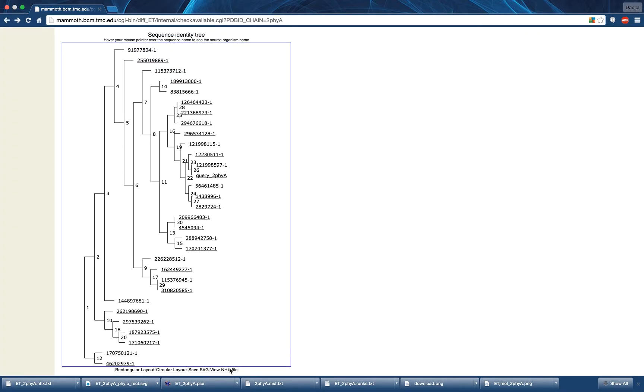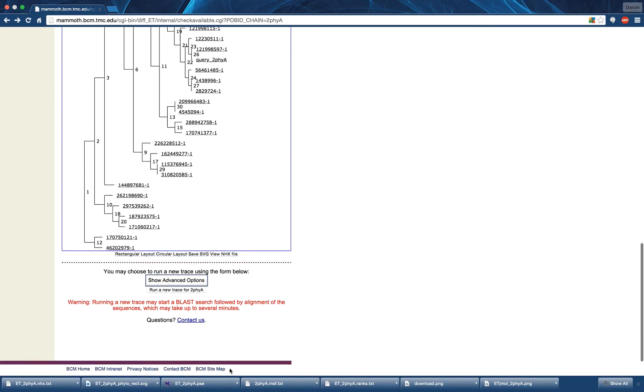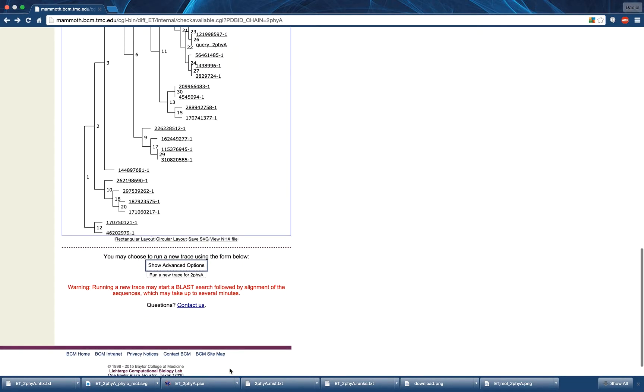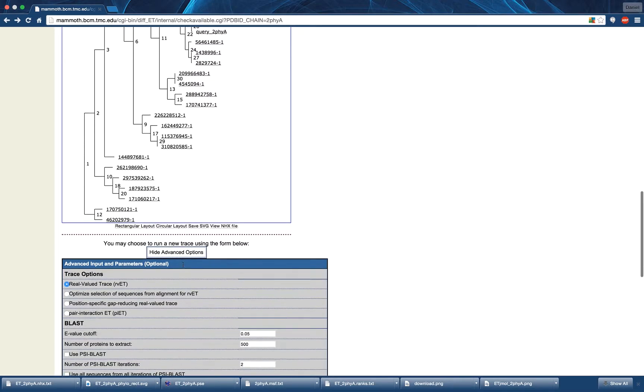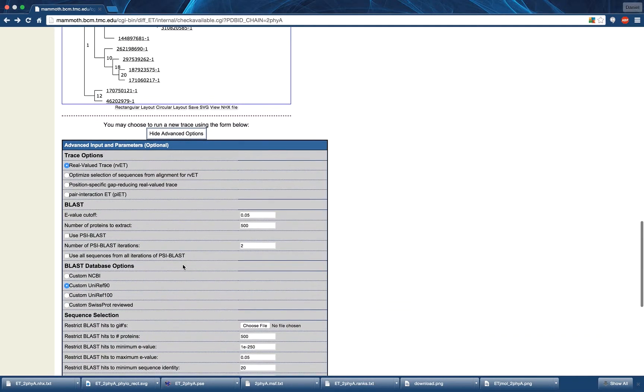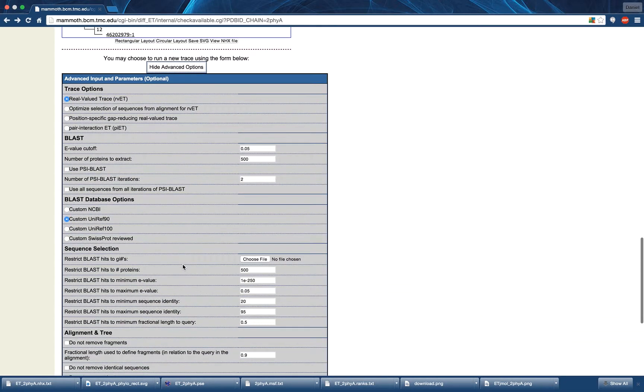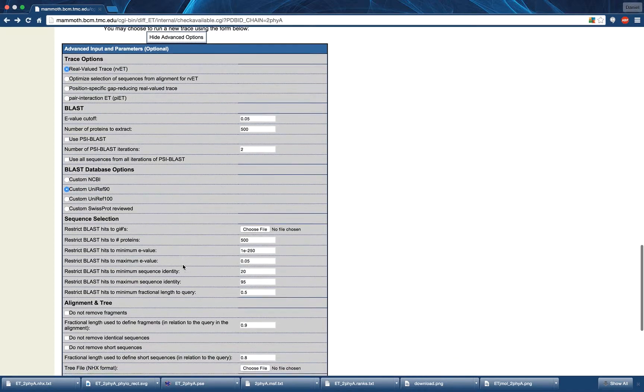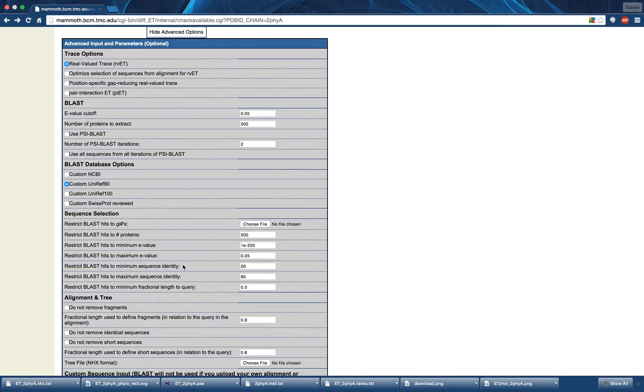The final portion of this page is used to run a de novo evolutionary trace. This is covered thoroughly in another video found in the displayed annotation. Here we would like to note that while users are encouraged to change the database used when retrieving sequences, some databases may produce very few results during the BLAST process, leading to a failed trace.